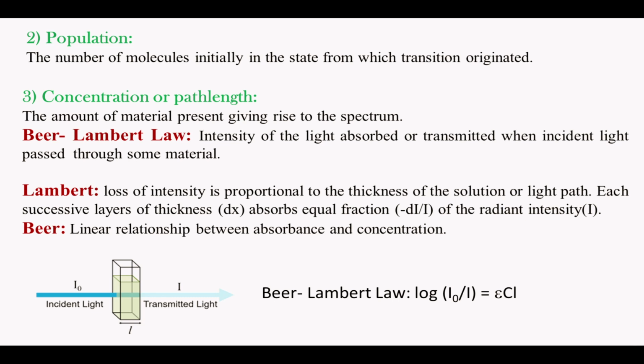This is equal to epsilon, C and L. C is the concentration, and L is the path length. Usually we take 1 centimeter, so L is 1.